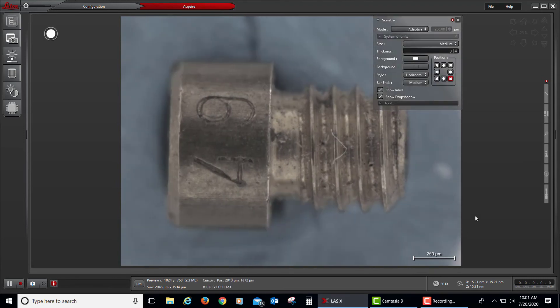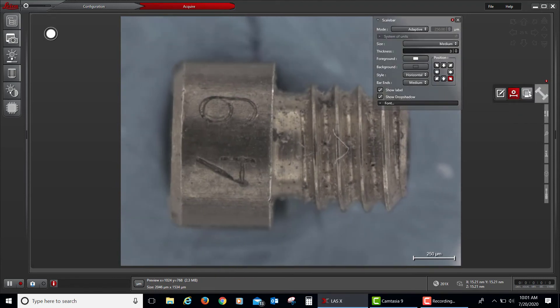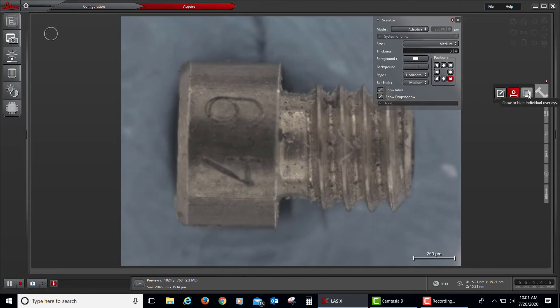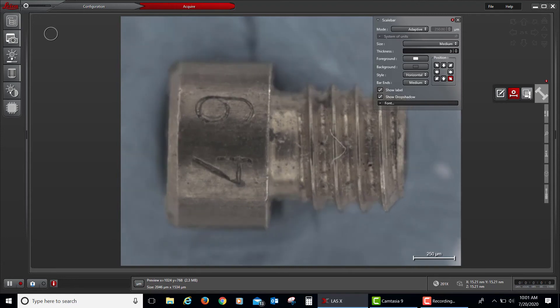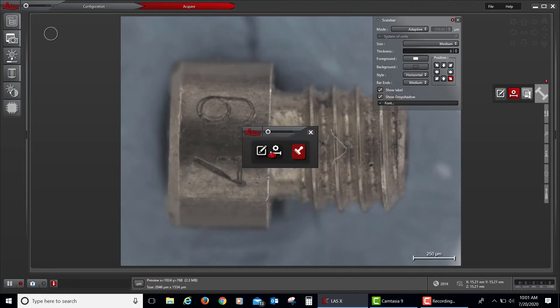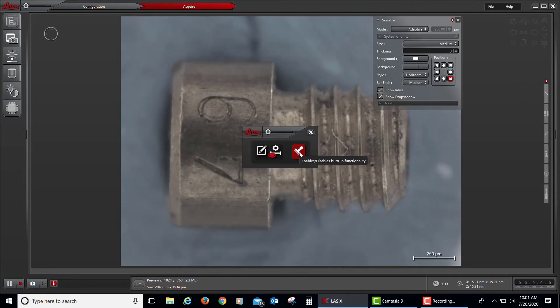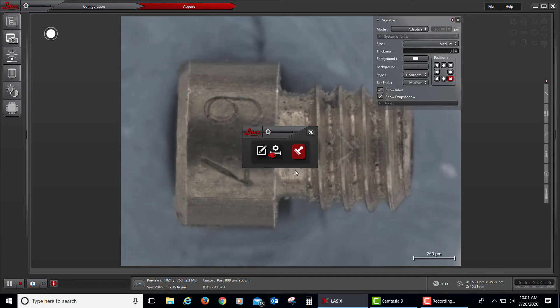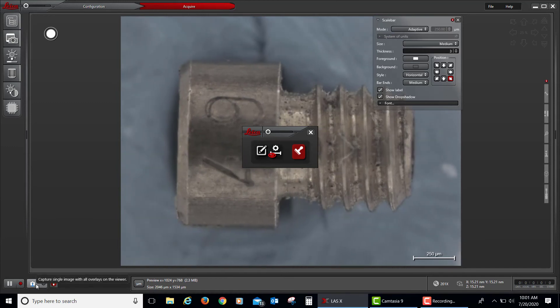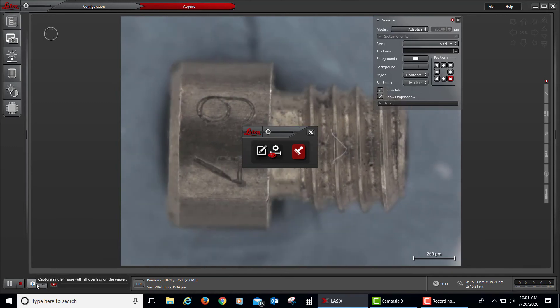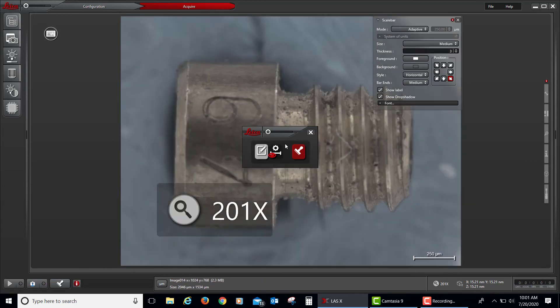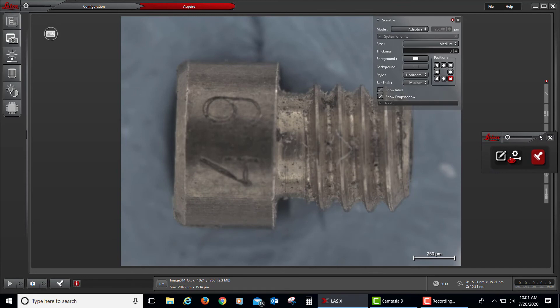Now that we have the scale bar on the image, we need to tell the software to burn that in when we acquire it. So to do that, we click on this icon closest to the button on the right-hand side and turn the button on that has a stamp. Notice that the icon in the lower left-hand corner now changes so that when we take a picture, it automatically burns the scale bar in. So that's one of two ways to burn a scale bar into the image.